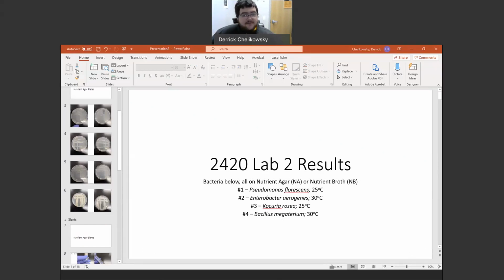This is a template for the rest of the course as well, so that you have an idea of what goes where and when. The biggest thing that I can tell you is draw what you see. Describe what you see. If what you see can't be described for some reason, that's fine. Do the best you can. We're not going to be docking points from you guys simply because the pictures are off. We understand that the pictures can be off. I'm taking these with my cell phone. Not the best camera in the world. It's certainly not a professional grade camera.